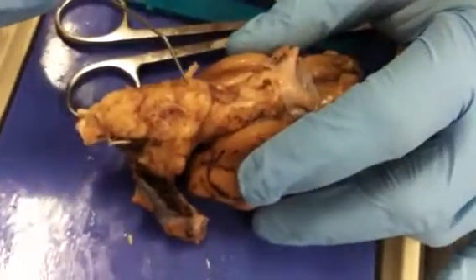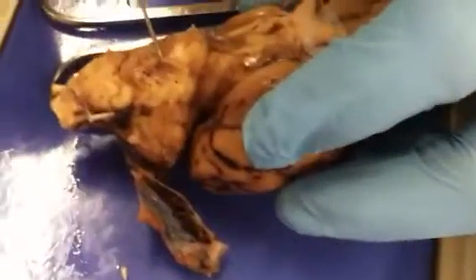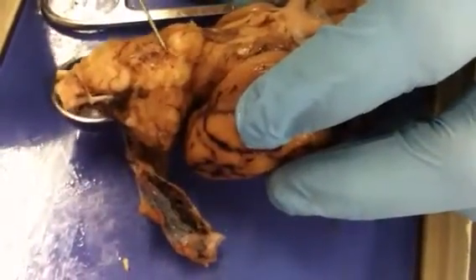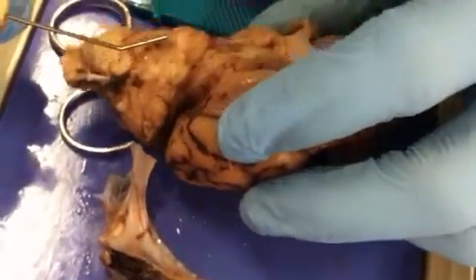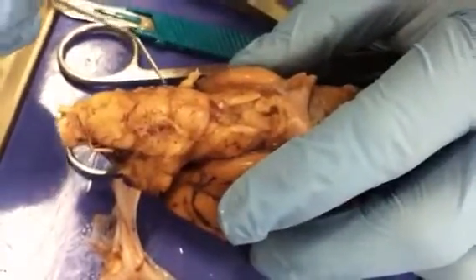And then the junction between the pons and the medulla. So here's the junction right there. You see the abducens coming off right here. Well, sure we do. Right there. I might have broke it off on the other side.